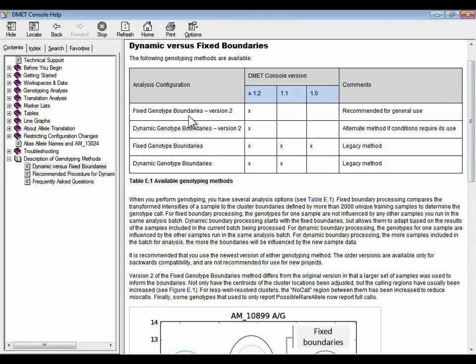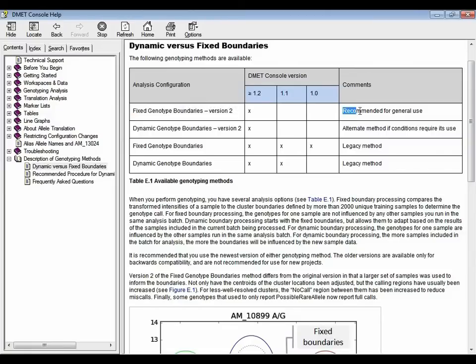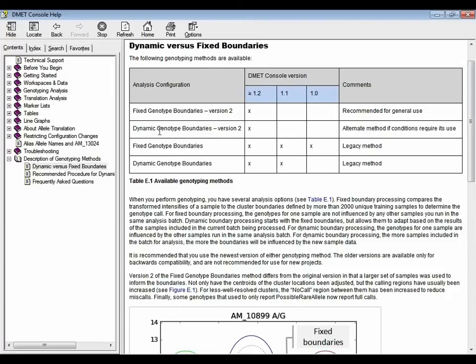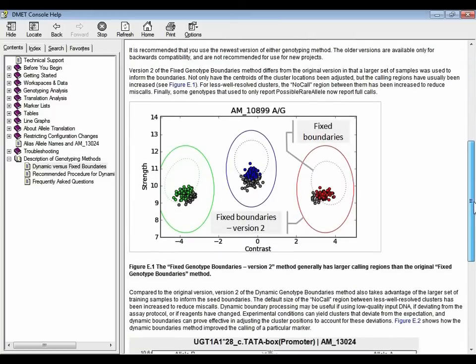So I mentioned the four methods. The first method in this table, fixed genotype boundaries version 2, is the one that's recommended for general use. Start with that one. There's another method called dynamic genotype boundaries. It's an alternate method that you can use to describe the differences between those methods. Let's look at this screenshot below.